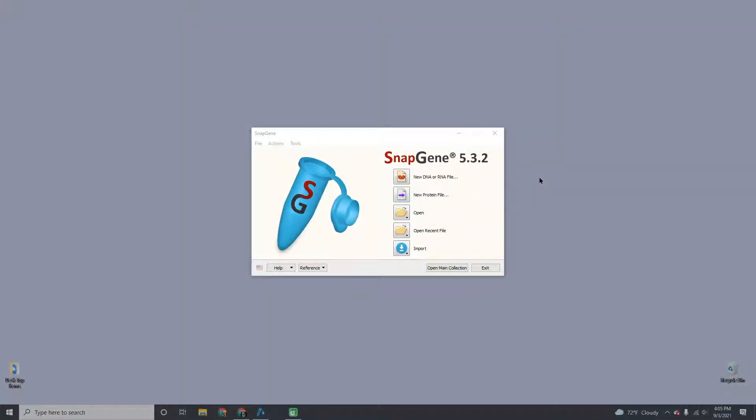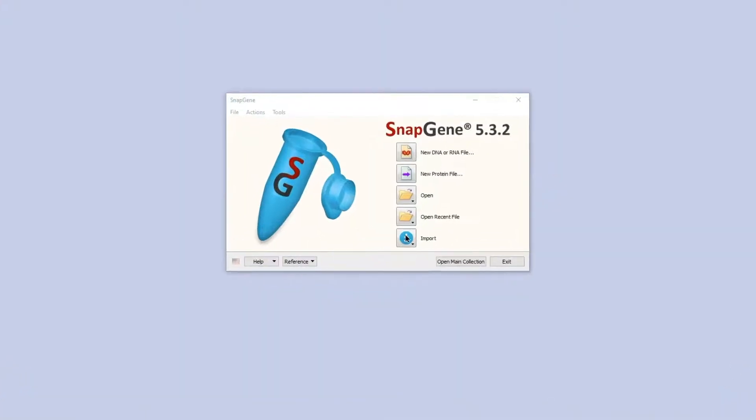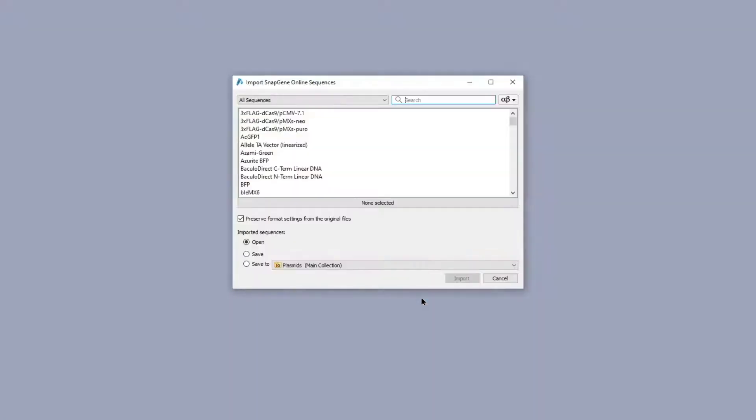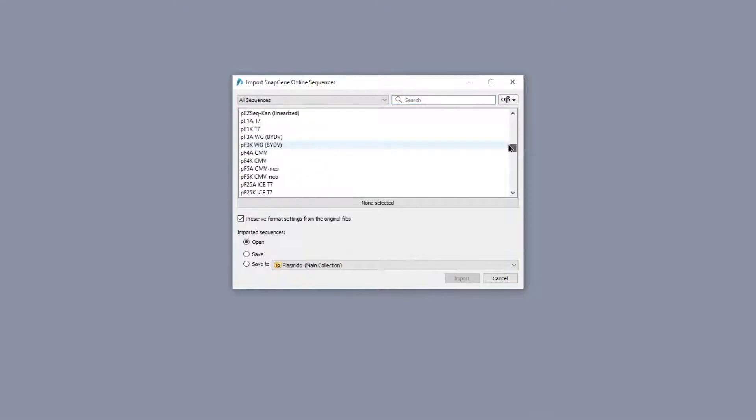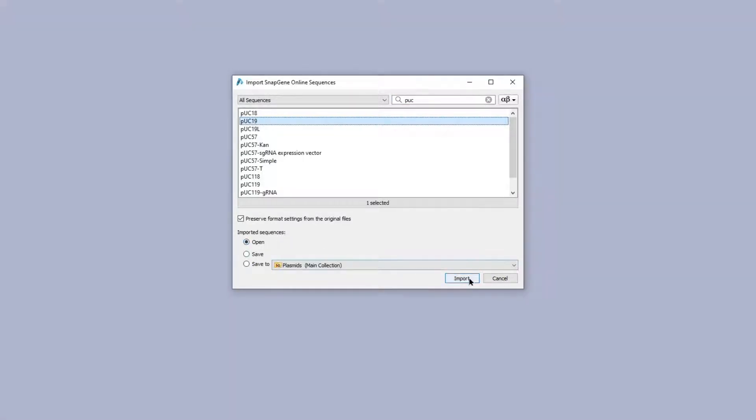You can select plasmids from the SnapGene online database, choosing from over 2,700 annotated sequences including common plasmids and cloning vectors. Save them for later or open them directly into SnapGene.